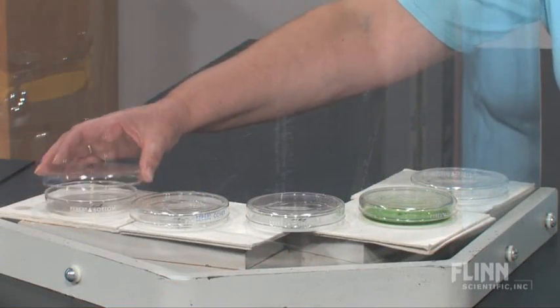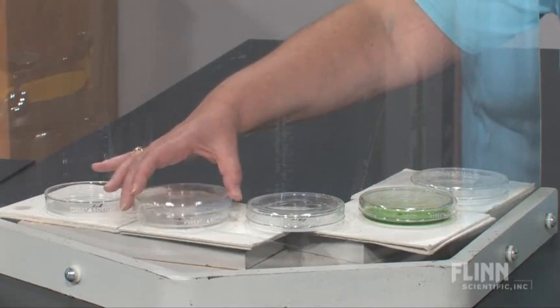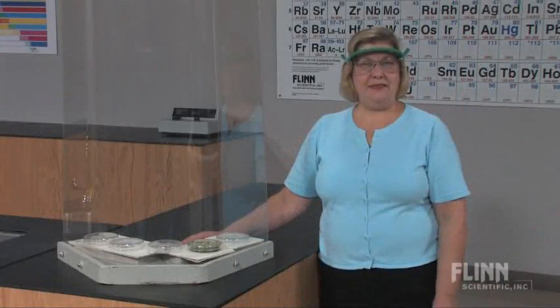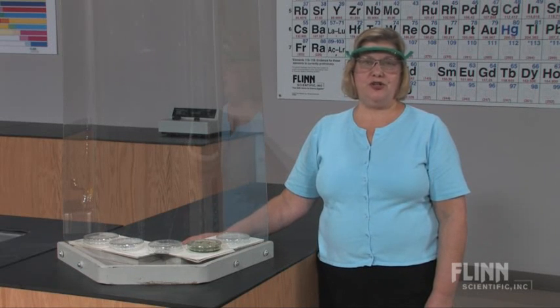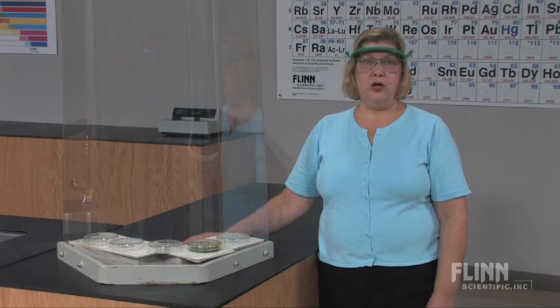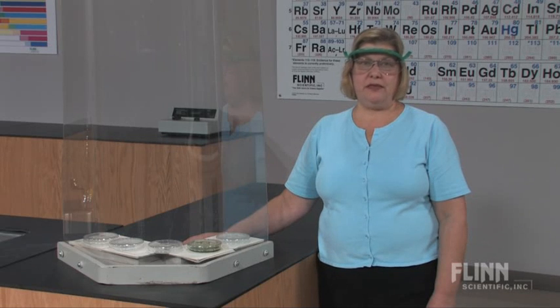Third, have the petri dish tops next to the dishes so that you can easily cover and extinguish the flames if needed. Finally, and this is most important, do not attempt to repeat this demonstration immediately afterwards or while the dishes are still hot. Residual heat will ignite the alcohol and flash back to the bottle. Never bring the methyl alcohol bottle back to the demonstration area.